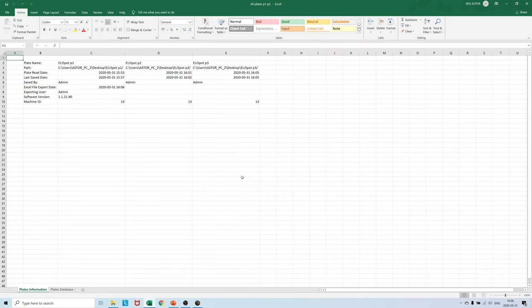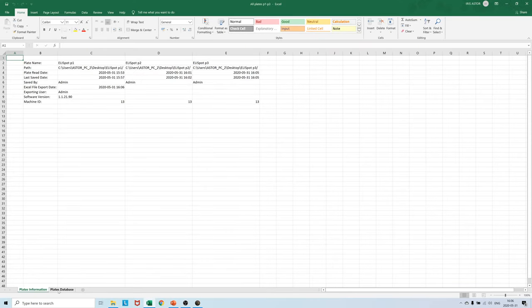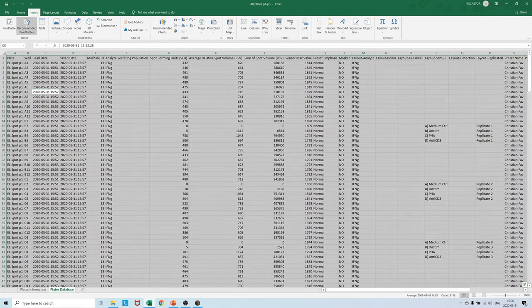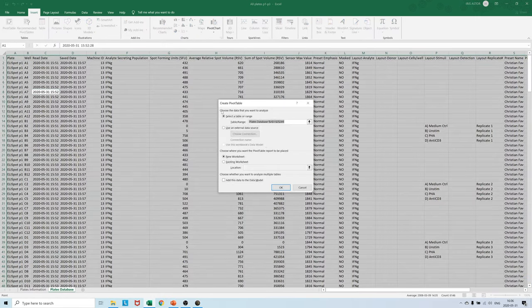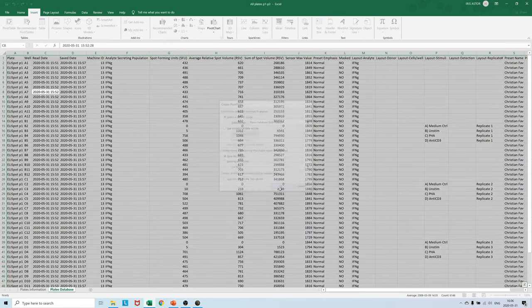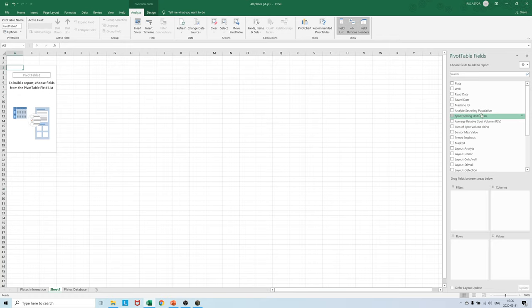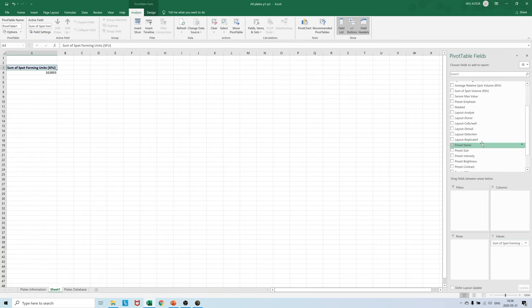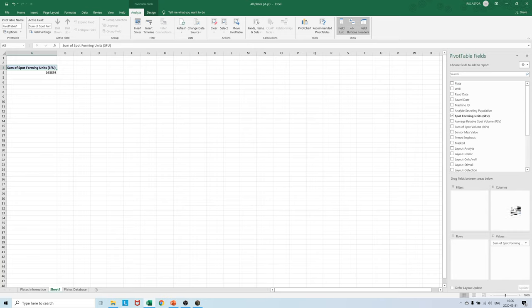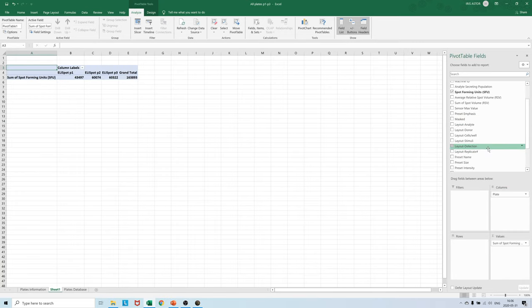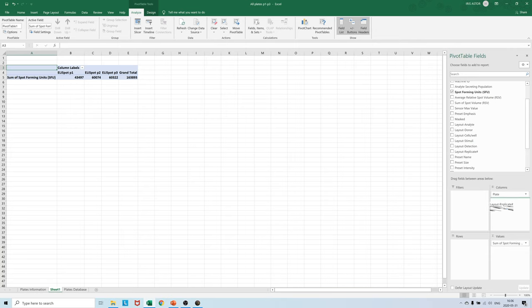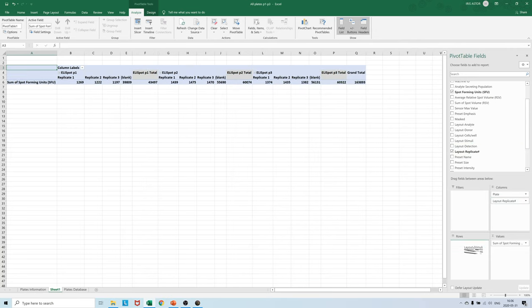This functionality is built into Excel and allows you to process large amounts of data in a very ingenious way. Tables are built by dragging and dropping the different variables you want and depending on the rearrangement tables can look the way you want them to.